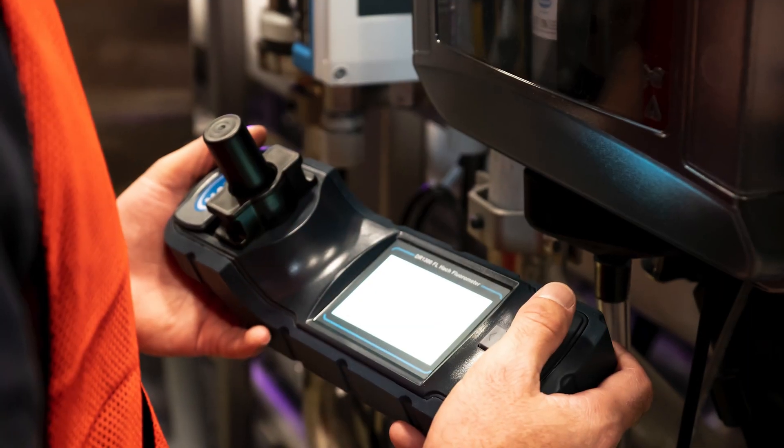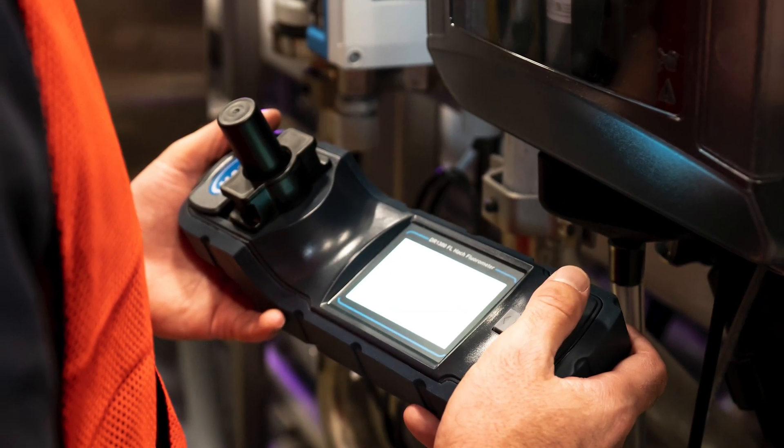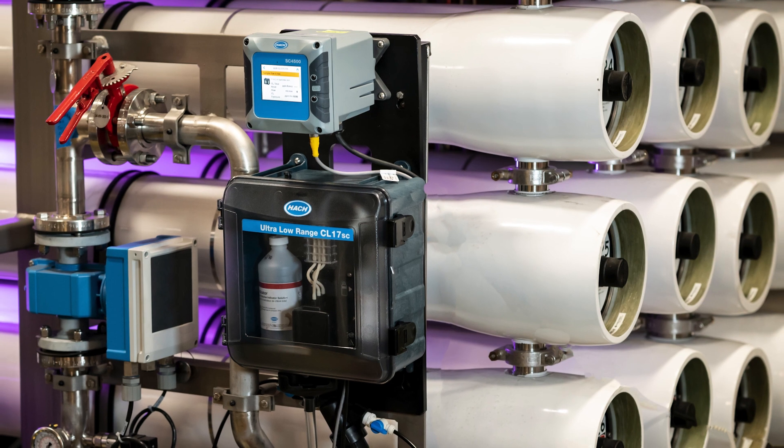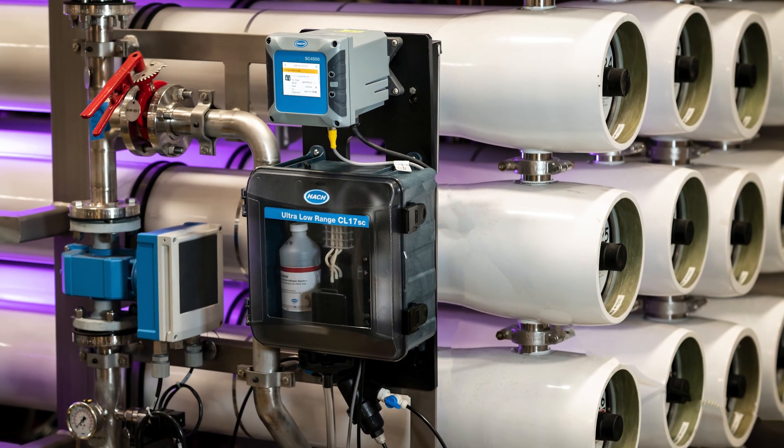That's where the new DR1300FL can come in and help by providing simple, fast, and accurate ultra-low range tests to validate and verify that that analyzer is running properly.